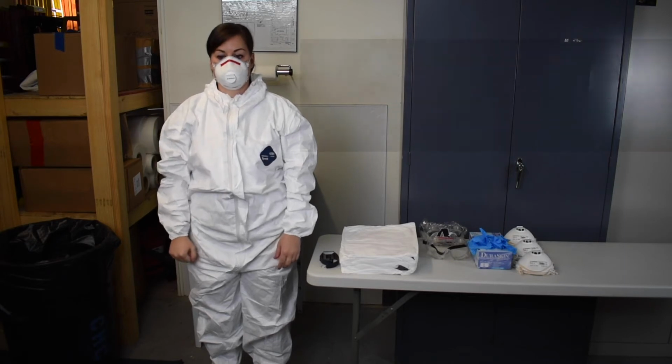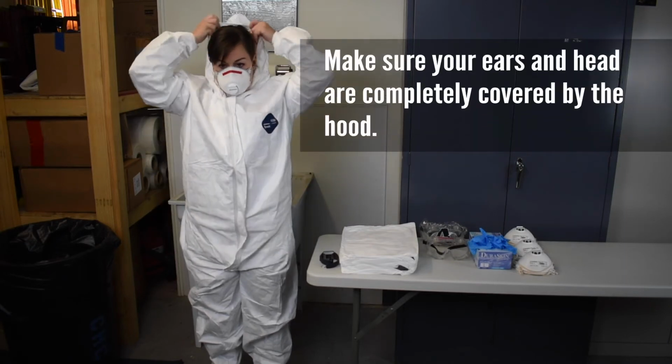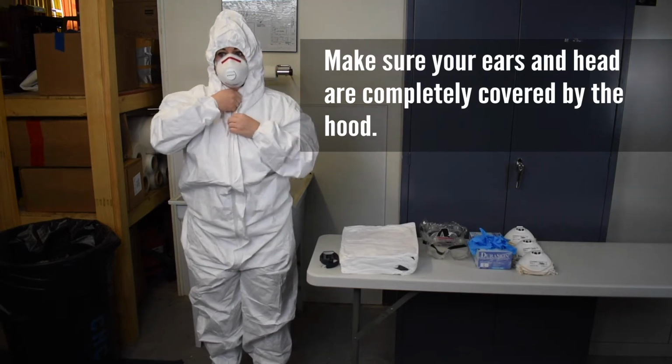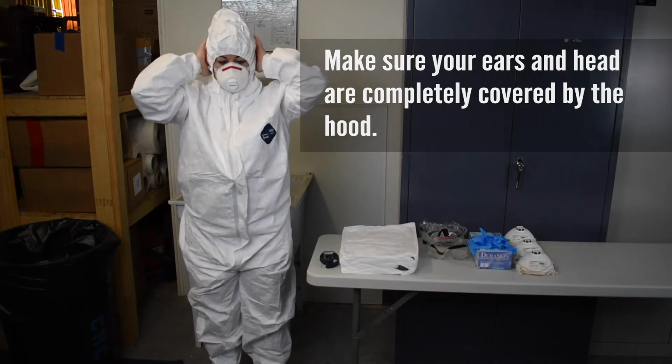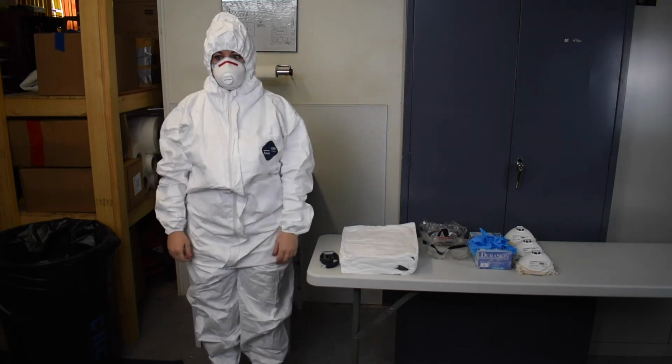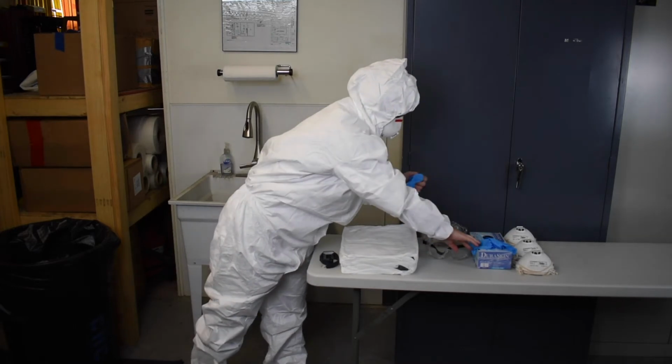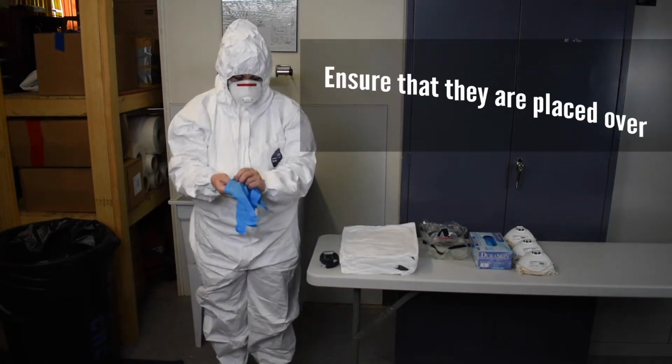Next, put on your coverall hood. The hood should cover your hair entirely. Make sure your ears and head are completely covered by the hood. Next, put on your gloves, ensuring that they are placed over your coverall sleeve for overlapping coverage.